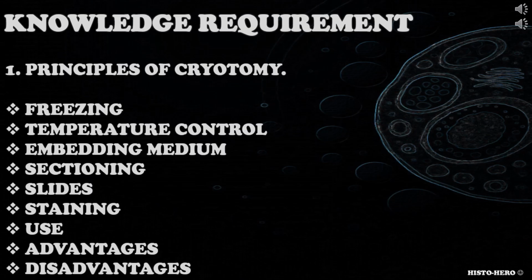The first knowledge requirement is principles of cryotomy. Candidate needs to have the knowledge and understanding about principles of cryotomy. You could ask the candidate to explain what is cryotomy, why it is important, when is cryotomy used over routine paraffin wax processing, or what are the principles of cryotomy.